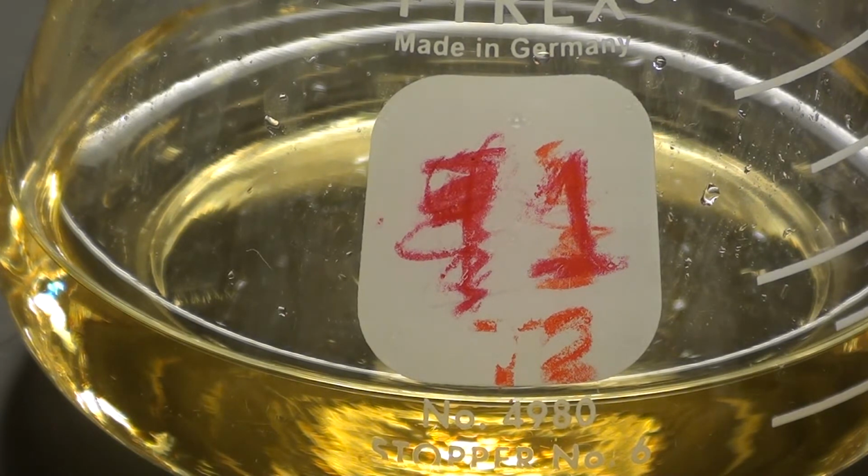It's still coloured at this point. The colour is lightening up a little bit right now. It's now a lighter yellow, and Samuel will turn the timer off as soon as that colour changes. So it's getting there, it's not quite there yet, and now the colour has gone. So there you go, that's how the change goes.